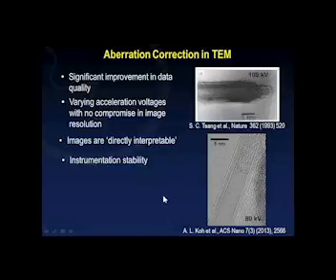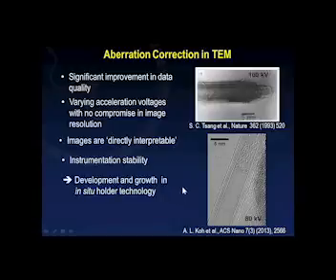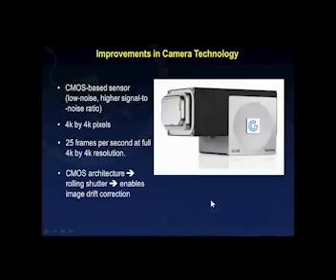So modern TEMs are a lot more stable, and I would in fact say that the combination of aberration correction and improvements in instrument stability actually spearheaded the development and growth of in-situ holder technology that we have seen in recent years. The second improvement is the improvement in camera technology.